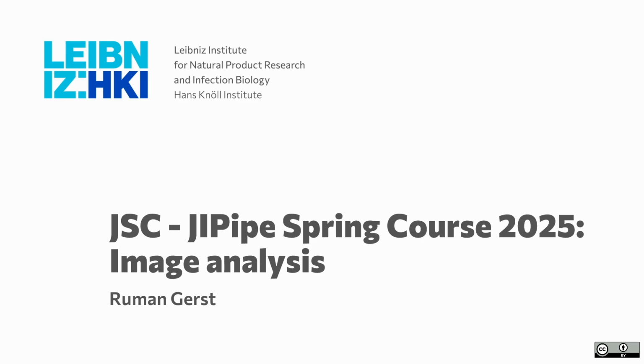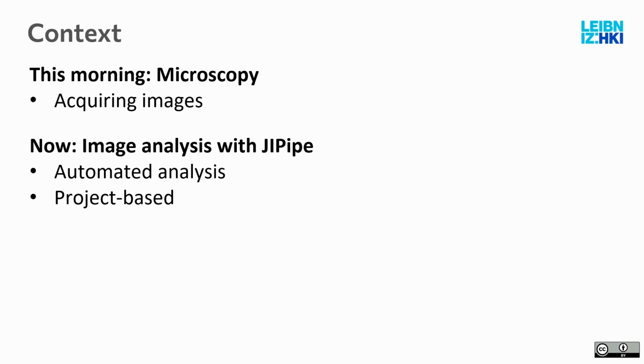So, welcome to the second part for today. This will be about image analysis now. This morning you had a lecture about how to acquire the images, all the techniques that are related to it, and the things that you need to know and take care of about getting the image properly done. What systems are available to do this. But now we assume this is done.